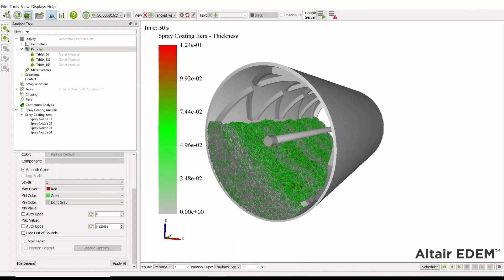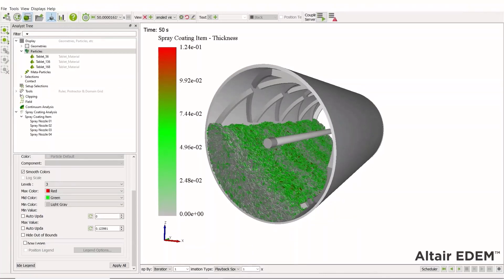That's the analysis of our spray coating. We can do further investigation — using the data export we'd be able to do further number crunching. It's clear that after 50 seconds, not all the tablets are coated evenly. We can run for longer, look at changing our spray zones, and change our kinematics as well. Thank you for listening — I hope this video on ray tracing tablet coating in EDEM was valuable.